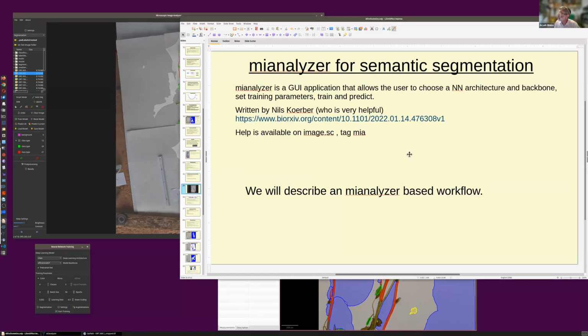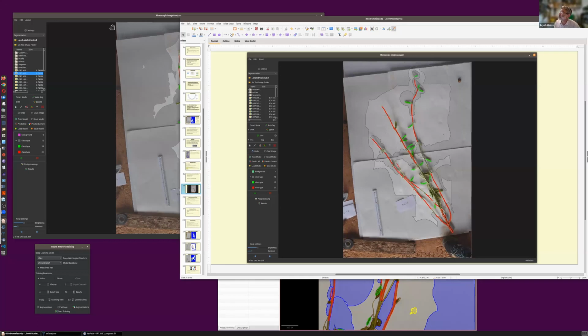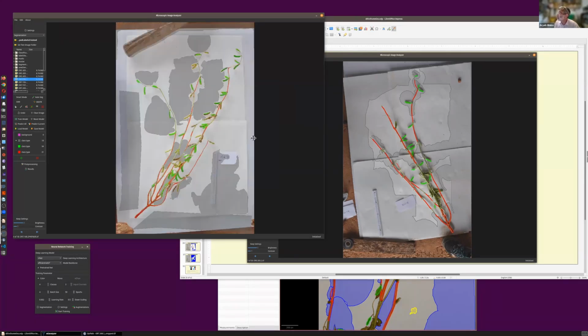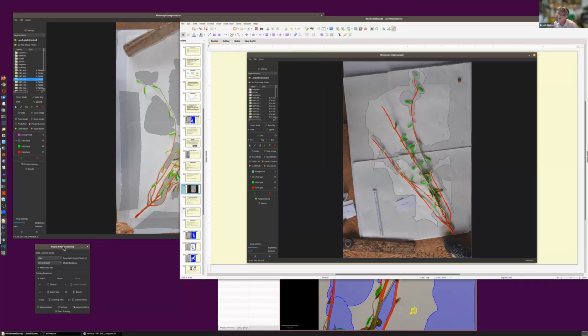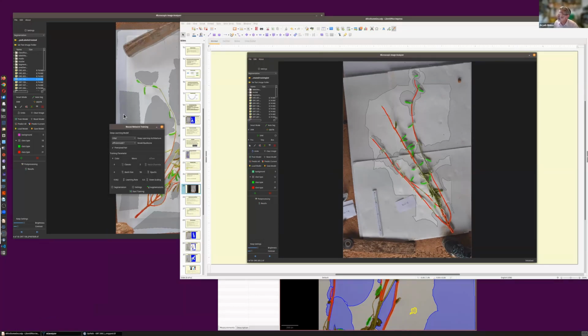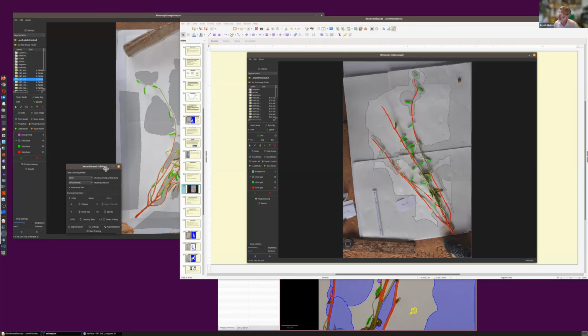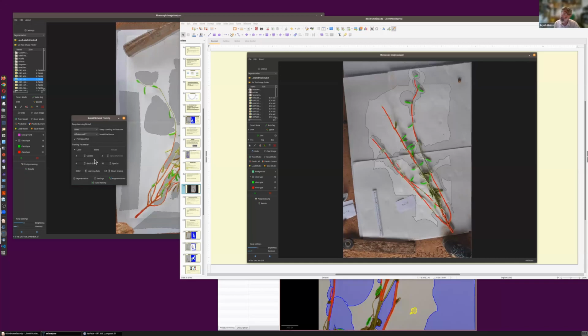So here it is. This is the same graphical user interface that I'm showing you here, right? The only thing, this one I can actually change pictures. What you can do with this menu is choose your architecture. Here, again, you don't have to be able to read them, but ResNet 50, SE-ResNeXt 101, EfficientNet B0 and all these things. You could Google if you want to know what these backbones actually are, but they're all architectures for neural nets, and you can select them just by a click of the mouse.